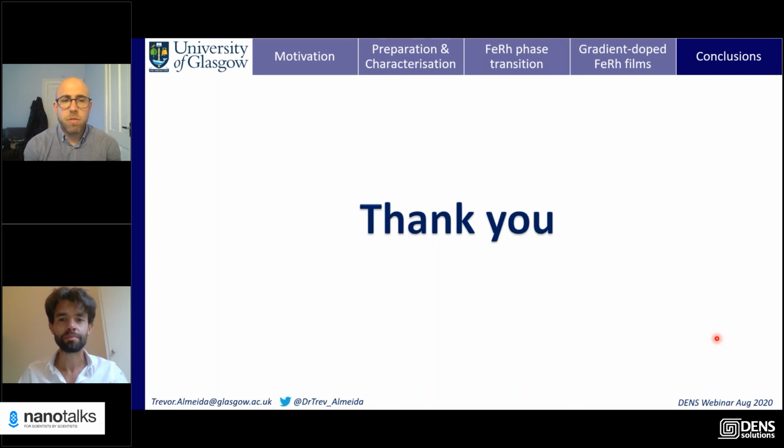So packaging, do you mean for the processing of the 4D STEM data? We use a sort of in-house Python code, which was written by people within my group. I do believe it's online. It uses Python, although I did use some C++ programming on a GPU before, because you get large data sets of about 8 GB for one image. So if you email me, I can send you a link. It's online, if you're interested in that.